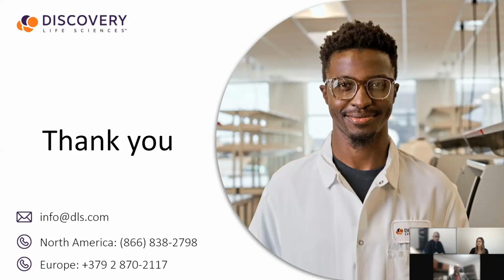And we are consistently producing very high quality data, irrespective of the collection or sample or tissue type, whether it's skin or hard to digest tissue. There are a few modifications you have to make depending upon the tissue, skin being one of them. I'm not going to go into the secret sauce here, but you have to play a little bit with some of the sonication steps. Outside of that, it's very much feasible.